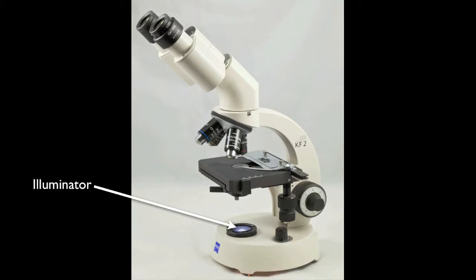The illuminator is located in the base. This is a light source together with lenses to direct the light up to the condenser underneath the stage.